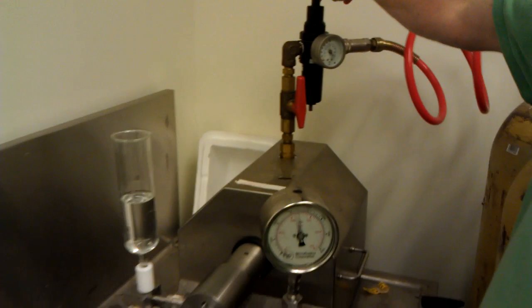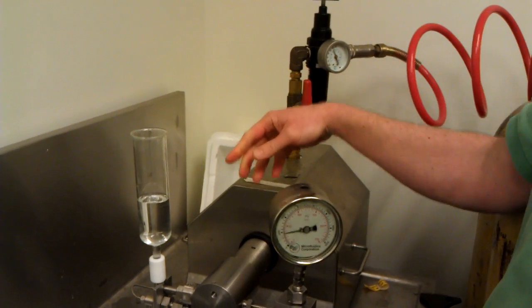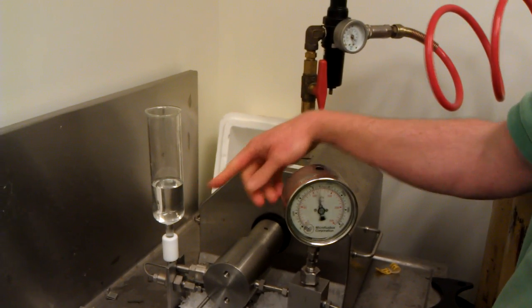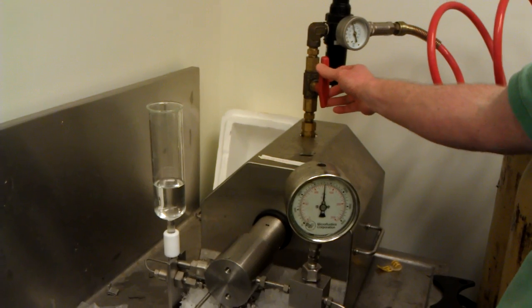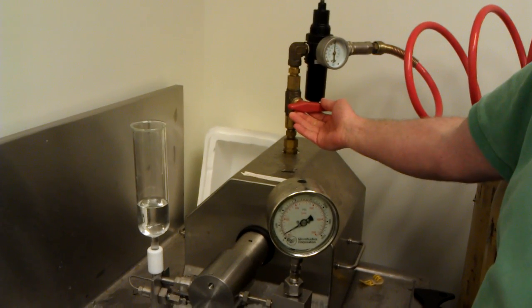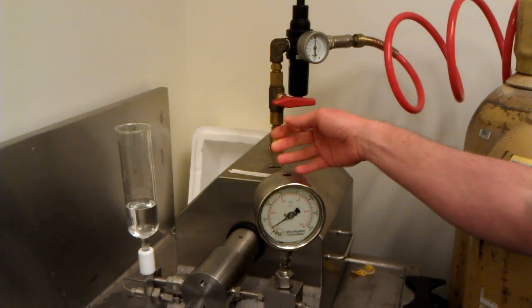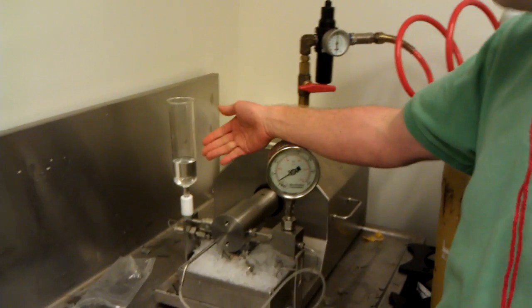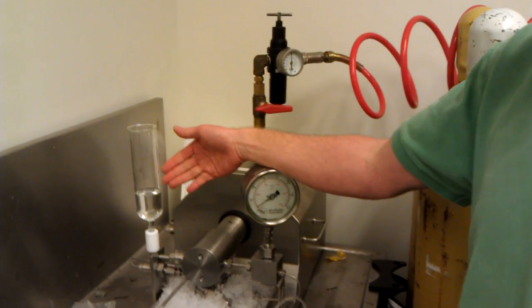As you increase the pressure, the unit speeds up. You should always adjust your pressure to the full funnel because you can see that the sample goes away really quickly. At this point I would turn off the instrument because I'm at the desired pressure, load my sample, and proceed with the lysis.